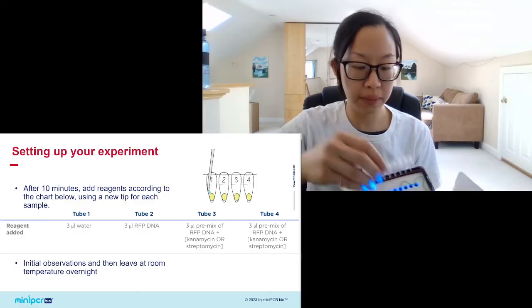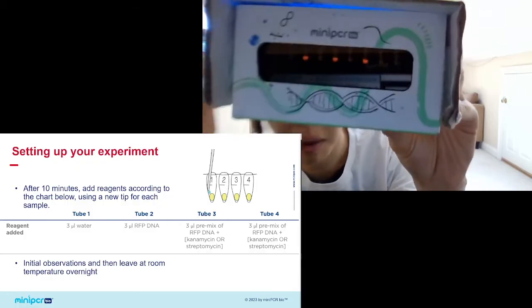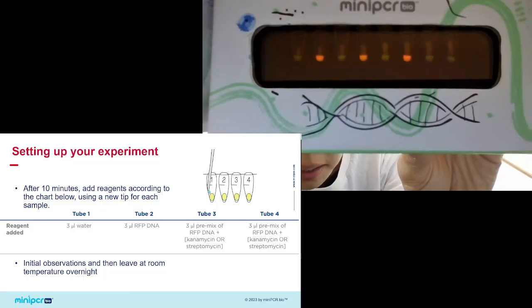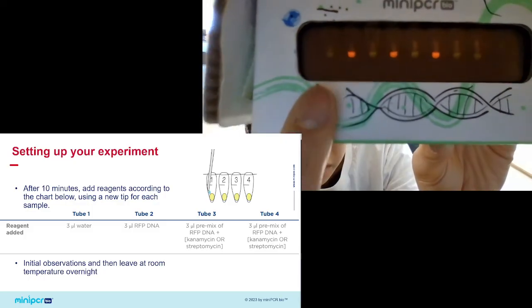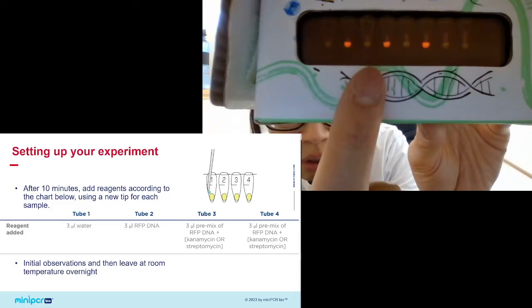All right, so here are the tubes that I set up yesterday. Let me put them in. Let me get the camera to catch them. All right, so on the left, I hope it's my left. So let's use my finger. Here, these ones, I think my camera mirrors it, so I'm just making sure.